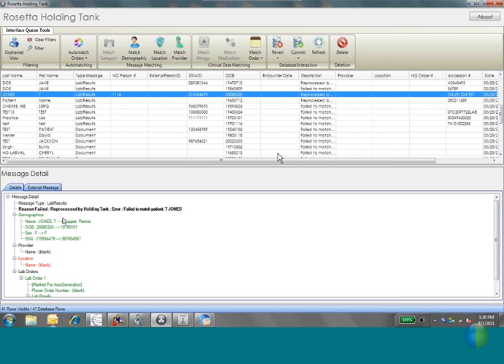But what I want to show you here is that the system will let you match it to somebody totally different. So they gave me T. Jones, and I did Penny Copper. So you can make a mistake. That's an important point to remember. You can accidentally pick the wrong patient here, and it doesn't catch you. So you always want to double-check your work, and you want to make sure that the patient's name matches, the date of birth matches, sex, and if you do social security number, make sure that matches.